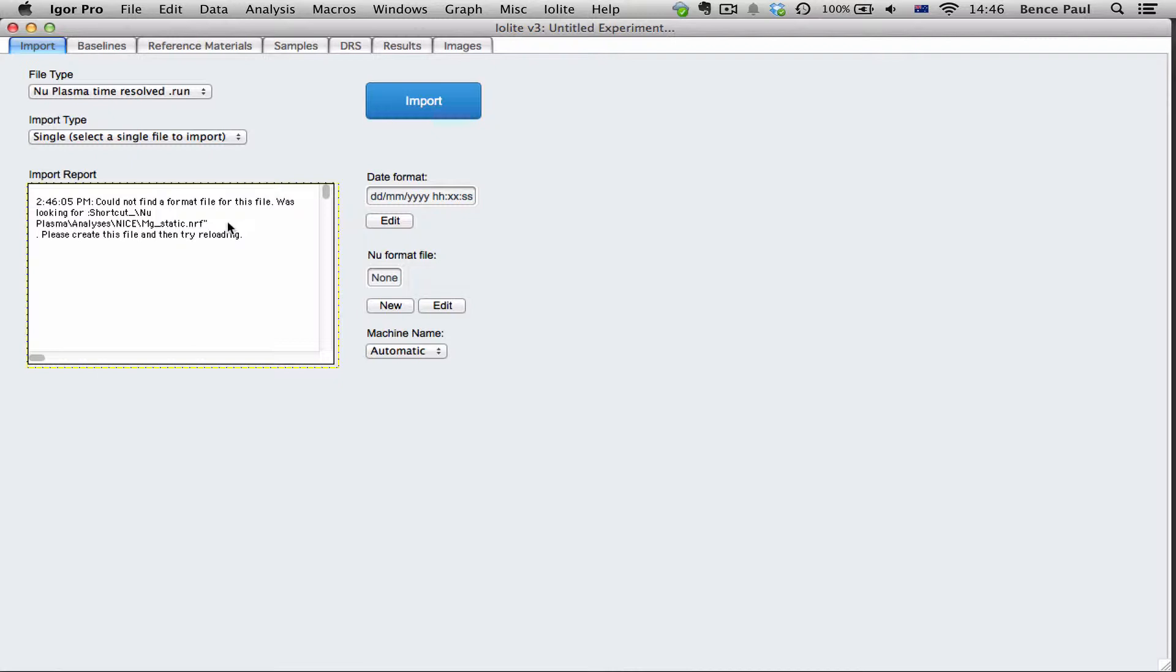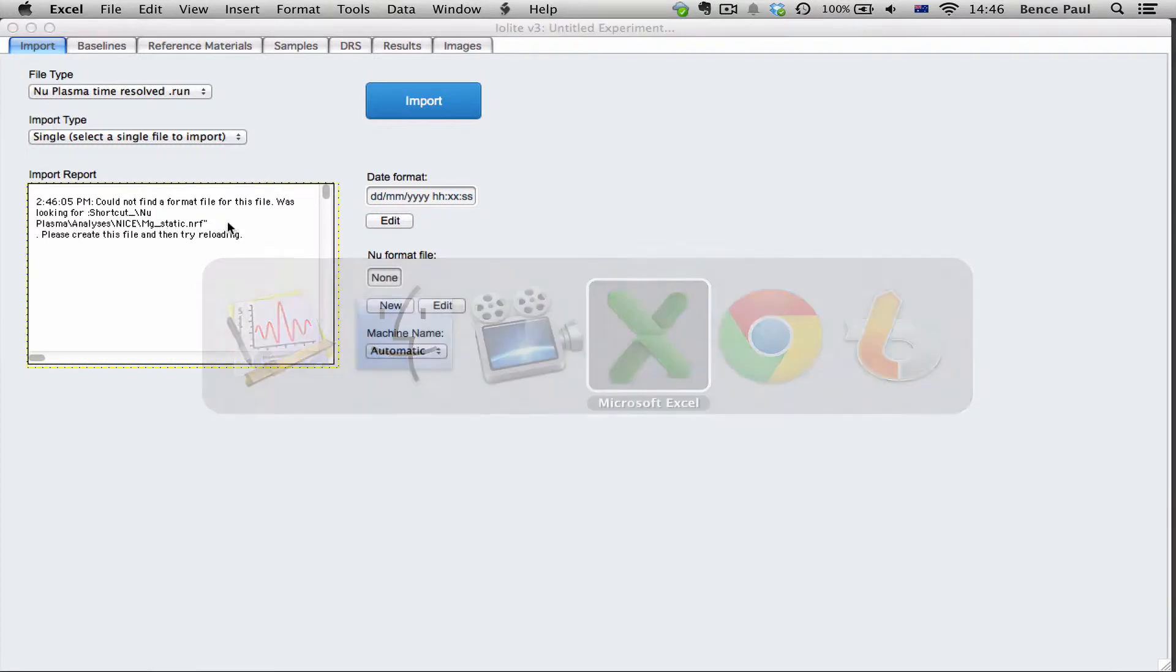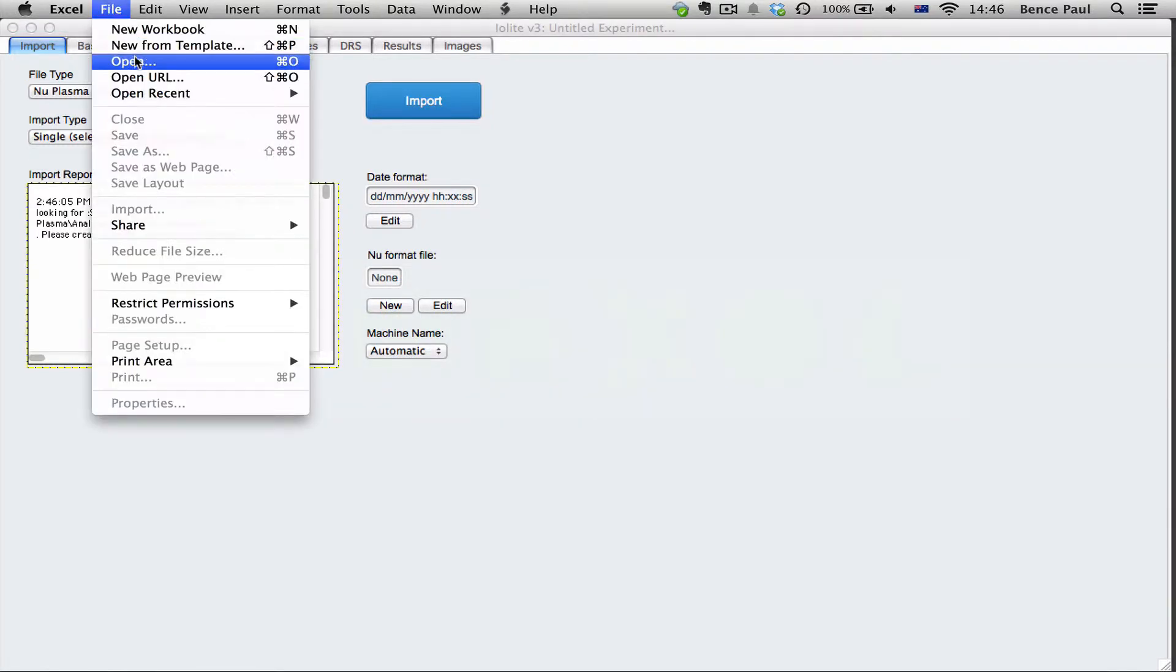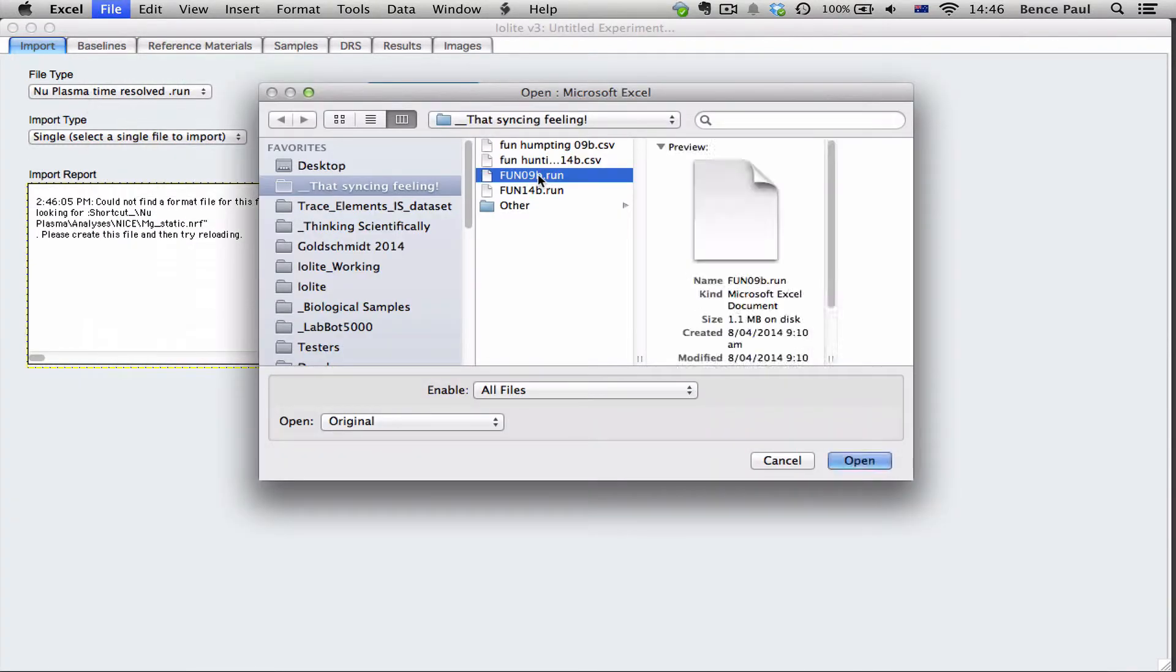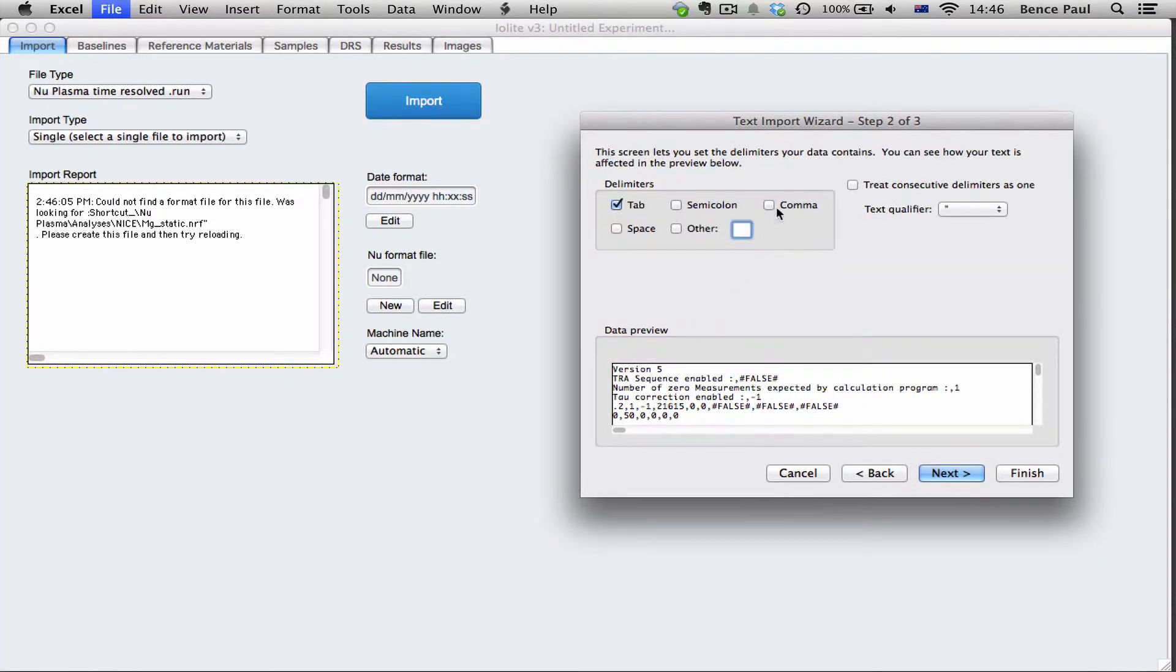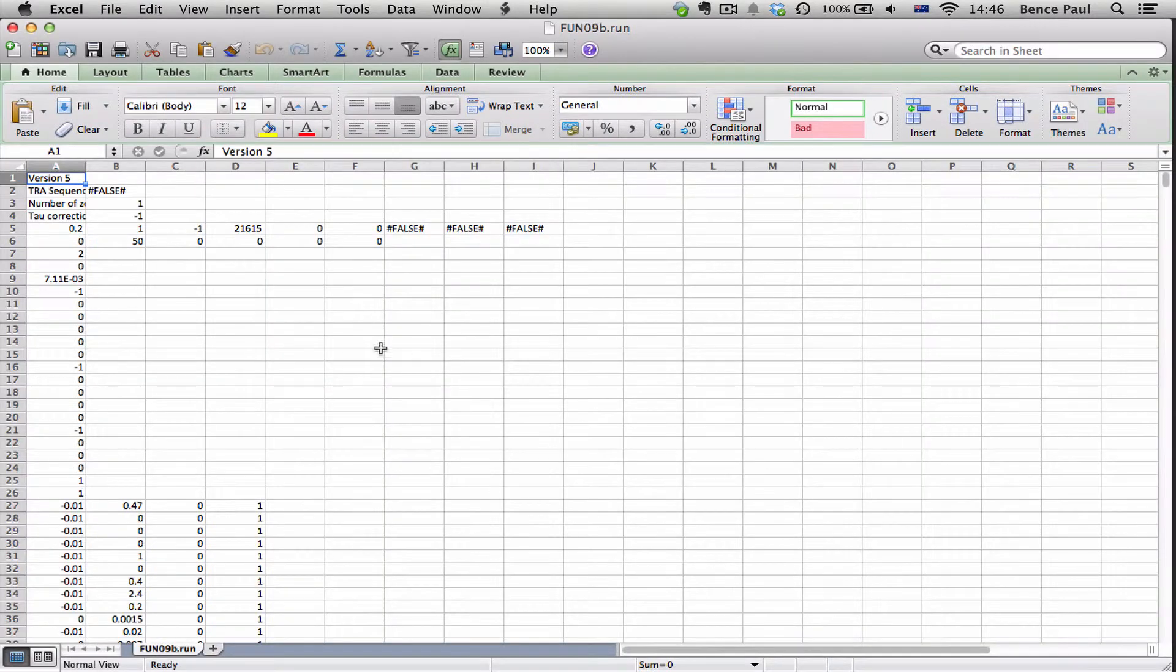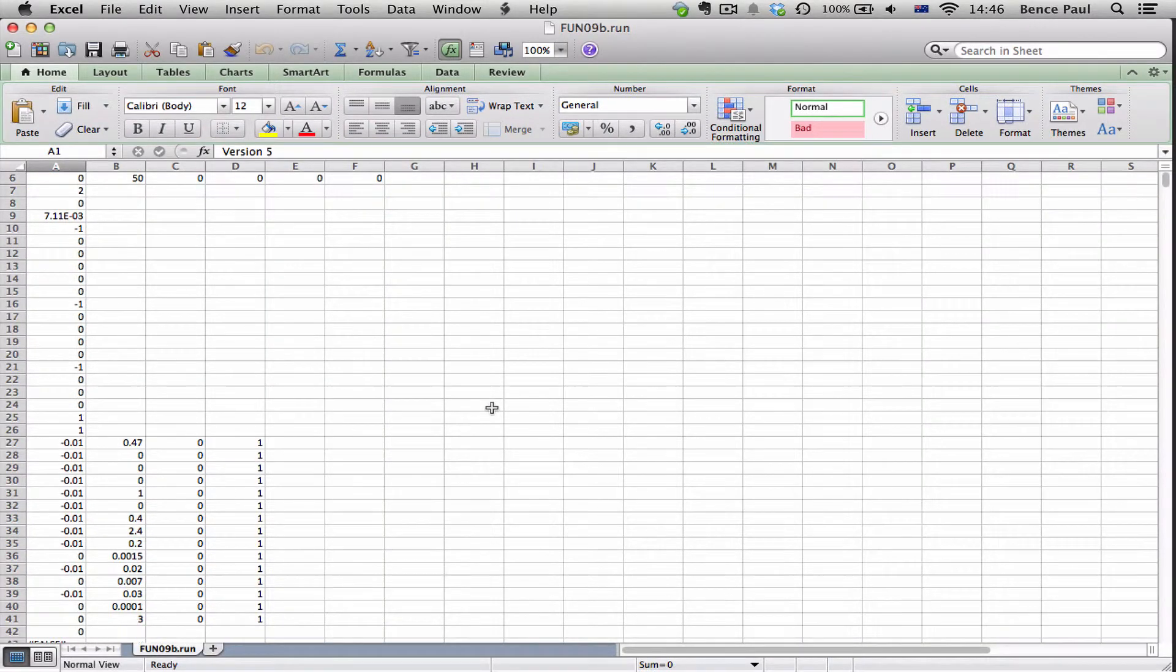How do I know that? Well one way you can do it is you can go to Excel and you can open one of your .run files. Make sure you choose delimited and choose comma and then you'll be able to see inside your .run file.